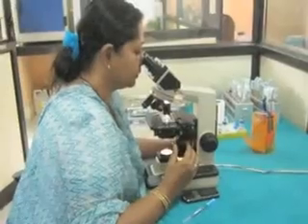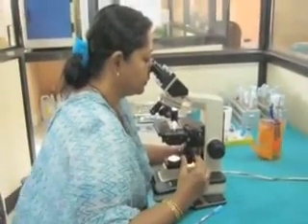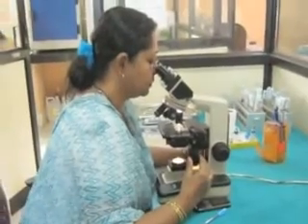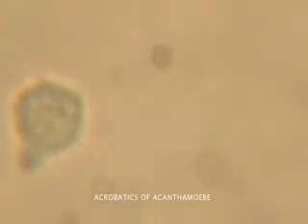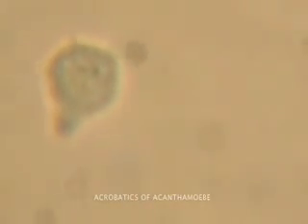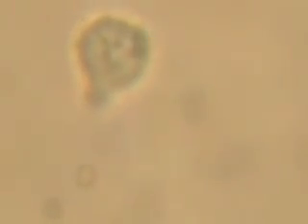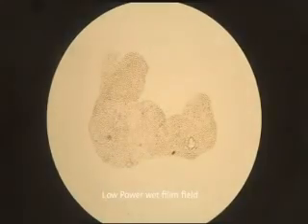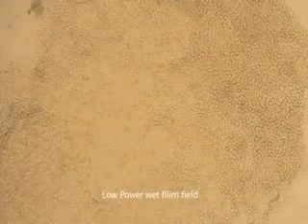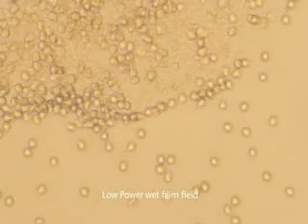This interesting amoeba captured our microbiologist's attention and she started documenting her observations. We invite the audience to look carefully at the acrobatics of this naughty and playful parasite in the following visuals. Look at these tiny specks and spots on the surface of the specimen. These may be mistaken for a normal pus cell.